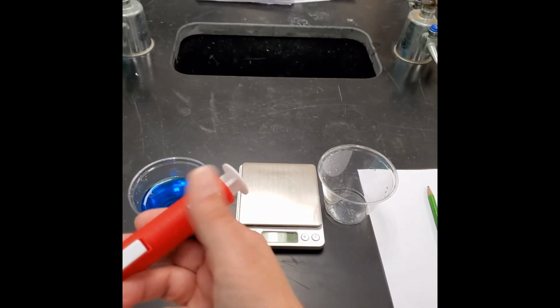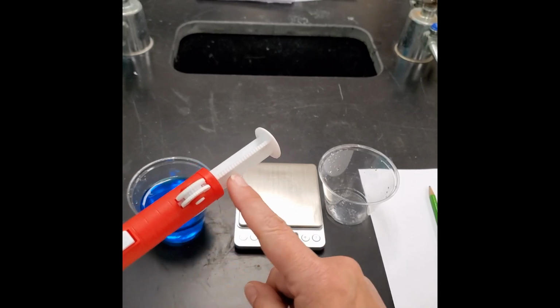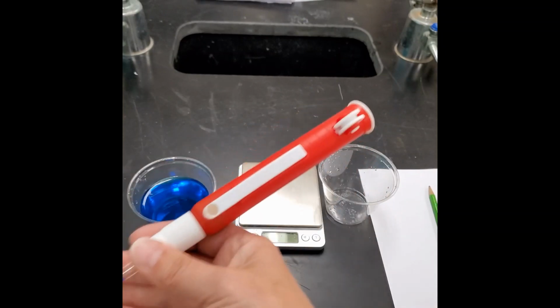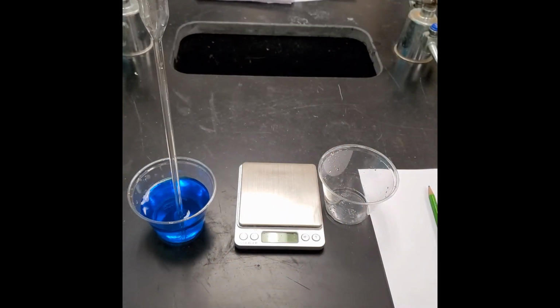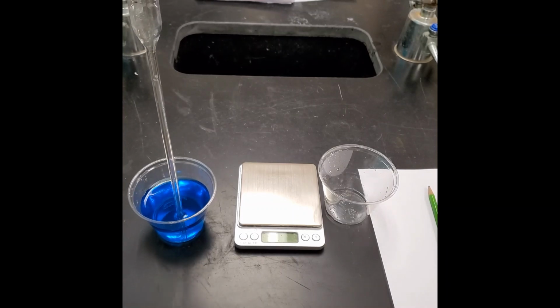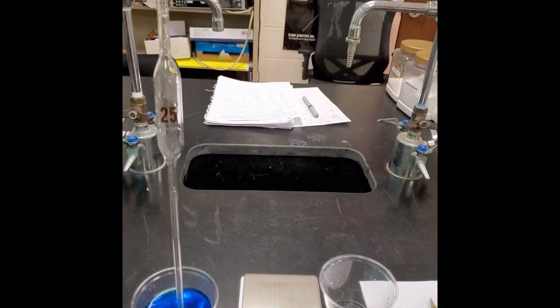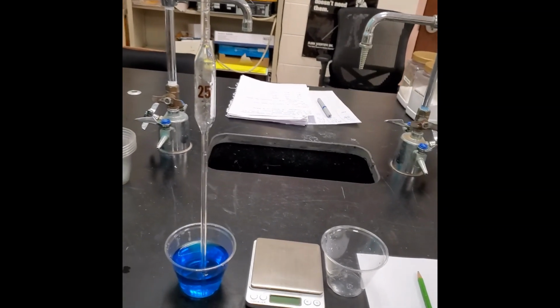Now we have a lever that you're going to turn down. This is going to rise, and as this rises, it is going to pull the liquid up into the pipette. Or the burette, excuse me. No, pipette, I'm sorry. Boy, end of the day. So you put it into the solution. Let me see if I can turn this up a little bit and maybe move it back.